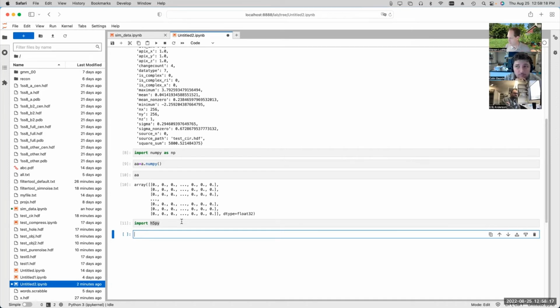How do you go about saving that to disk? So there are two structures that TensorFlow provides for easily saving these trained neural networks to disk. One of them is this really messy format, which basically makes a folder, and it puts a whole bunch of different files in the folder representing the different elements in the tree.